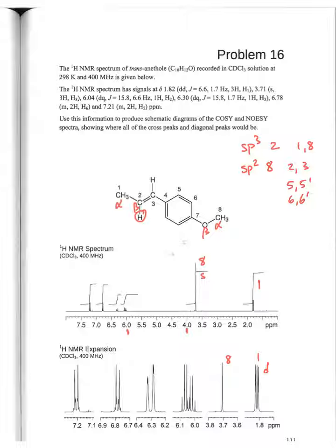And again, this is the logic you want to use to solve these problems in sort of an efficient manner. So try not to get bogged down on any one question. So now what we want to do is look at making the assignments in, for lack of a better way of putting this, the sp2 region.